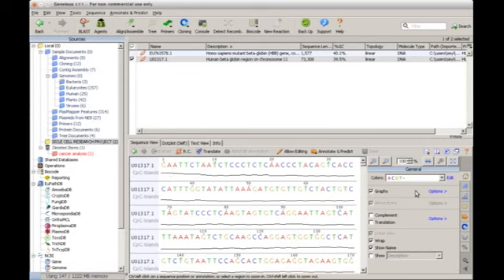First of all, you need to understand the stability of each nucleotide base in the sequence, because that's how you will understand the graph. Now listen very carefully. A is not stable in a sequence.